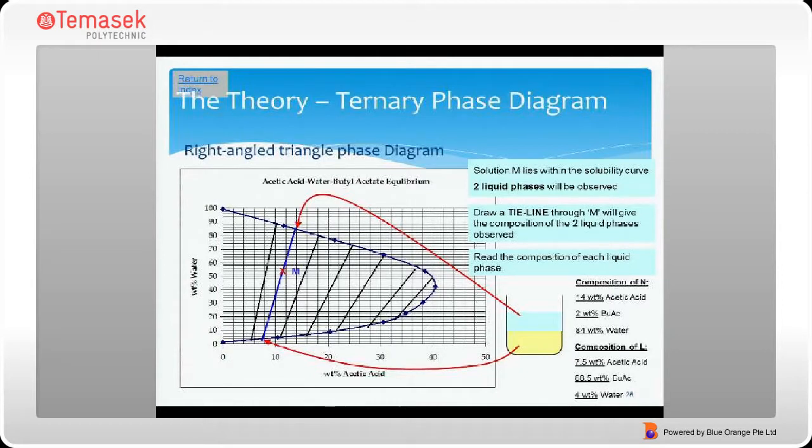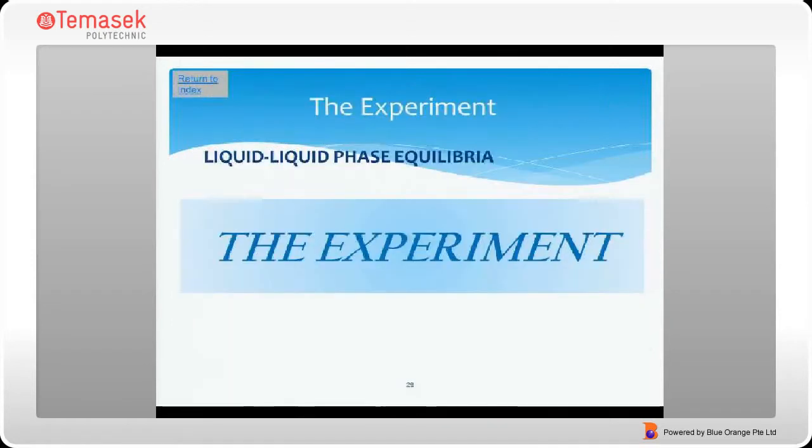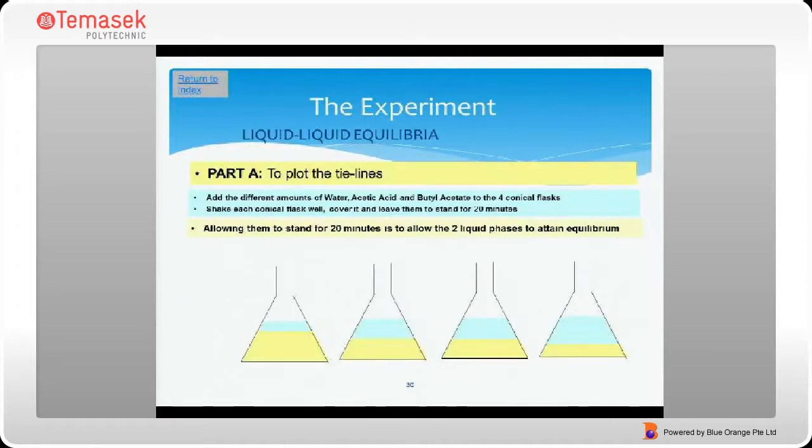Let's look at the experiment we will do today. In this experiment, we will use acetic acid as the solute. The other components of water and butyl acetate are insoluble in each other.